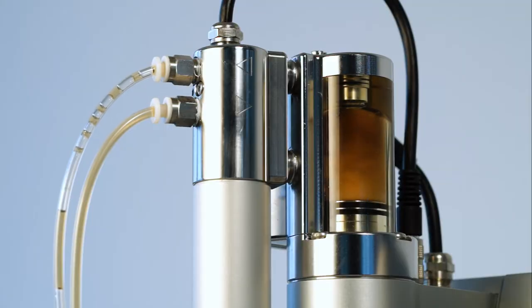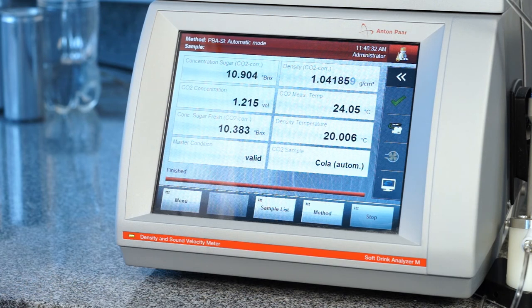As soon as the automatic filling procedure is completed, the PBA system will start the measurement sequence of all devices. The CARBO-QC-ME performs the multiple volume expansion to measure the real dissolved CO2 content without being influenced by the presence of nitrogen or oxygen in the filled sample, while Brix, density, pH, and dissolved oxygen are measured simultaneously. After three to five minutes, the entire measuring cycle is completed.